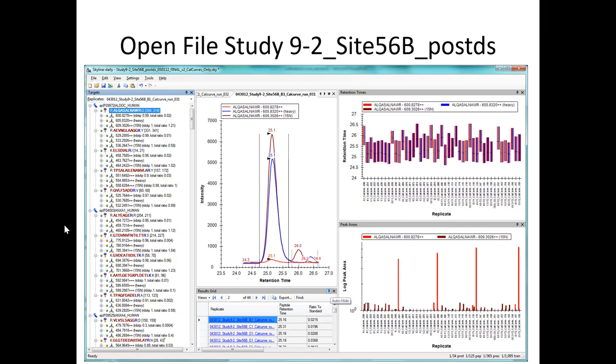So that you have an idea, going through this study, the blue and the brown should have constant signal throughout because those are our internal standards and those concentrations are fixed. The only peak areas that really should be changing are the red as we go through the different concentration points. All right, does everyone have something that looks like this?